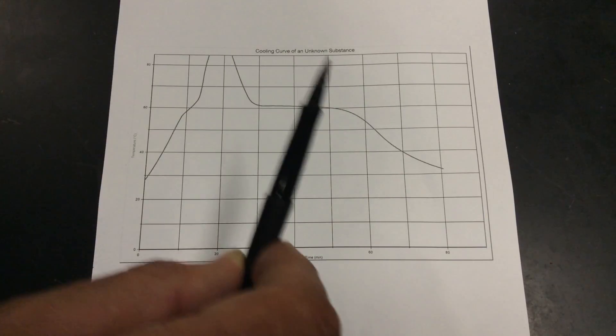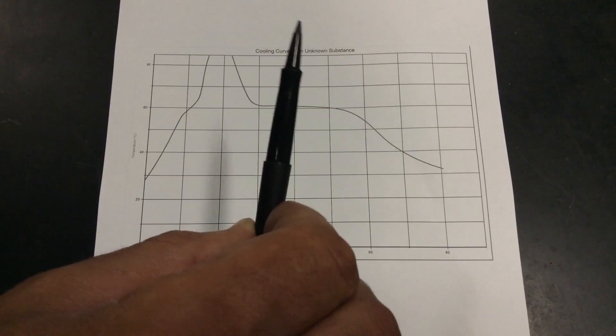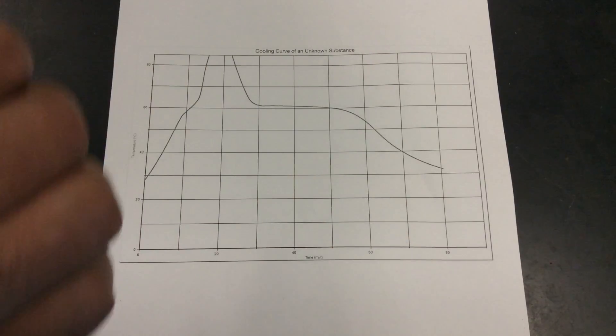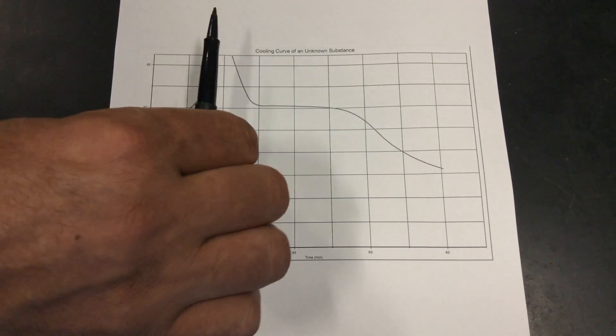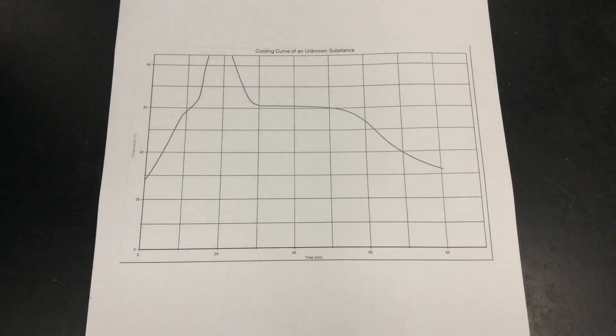I want solid, liquid, there's no gas, and I want the phase changes wherever you think they are for both the heating part of the curve and the cooling part. They should basically tell you very similar information, although one side is certainly more precise.